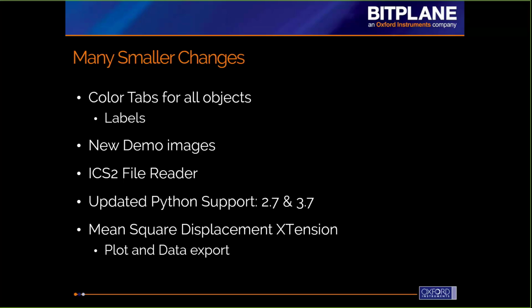So again, there's a ton of different things within this release, but there is this theme of trying to help you tell your story better, because we know that you want to spend your time talking about how your results are affecting your hypothesis, and you want to discuss what those really mean, and you don't want to have to spend your time going through all the details of what you see in your image. So if we can help you tell that story better, we think we've done a good job and a good service for you. In addition to having those distance measurements done a lot faster for you and a lot more easily for you as well.